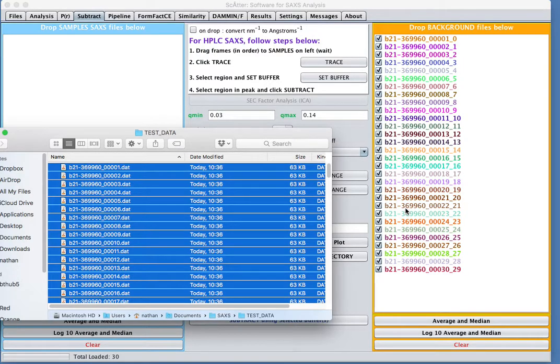One reason that they might not all be the same is sometimes when the sample is in the capillary from the robot, you'll find that the meniscus at either edge of the sample begins to drift a little bit, and if it clips into the beam, at some point during this run you'll get some sort of scatter spray off of the meniscus, and then as you get a portion of air into the beam, you'll see a drop in the signal at high Q.